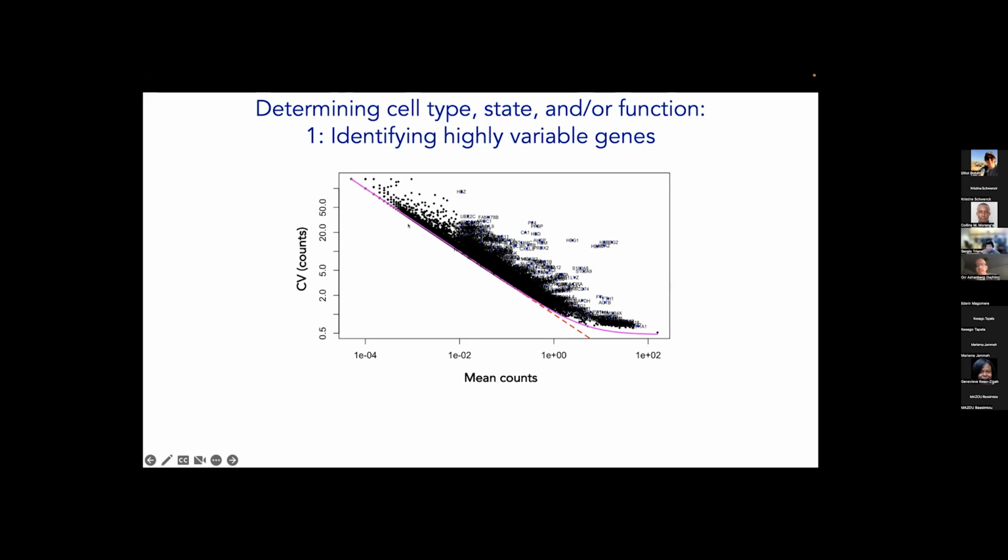There's a list I can get for you. I just don't remember what's in that list. But there's a few for sure that are commonly used. They're also not excluded forever. So the clustering is just to identify the cell types. But once we've identified the cell types, we go back to looking at all of the genes. So this is just for the clustering.